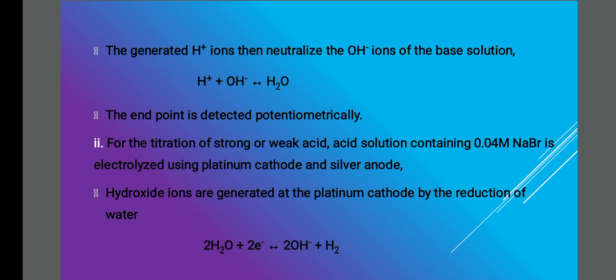ஏன்னா நம்மளோட base weak base இருந்தாலும் strong base இருந்தாலும் நம்மளோட solutionல என்ன இருக்கும்? OH minus ions will be there. So அதை water ல இருந்து generated H plus ions will be neutralizing that. So the end point is detected potentiometrically.